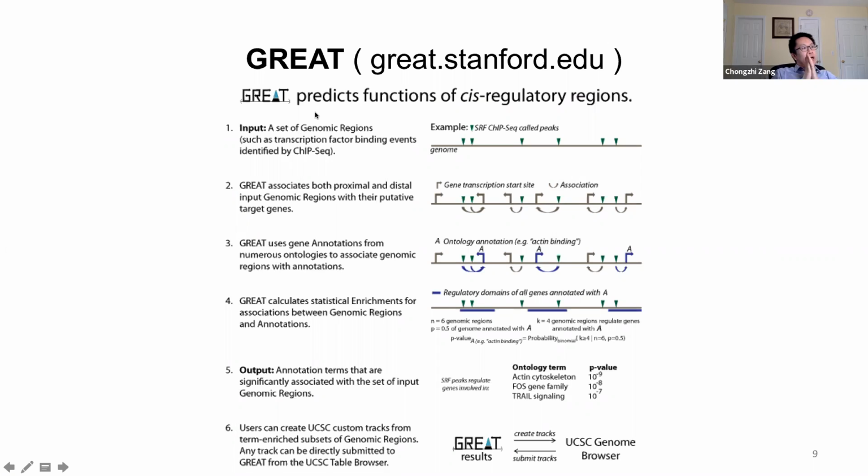It's similar to gene ontology analysis. In usual gene ontology analysis, you input a list of genes, and it compares the genes with known databases with annotation of what functional group the genes belong to.